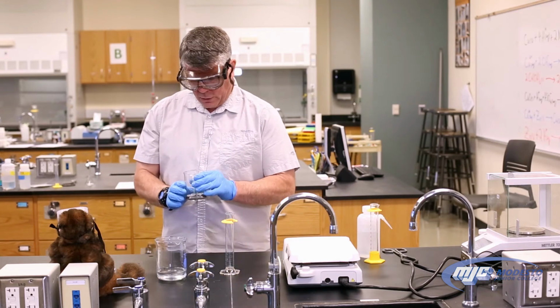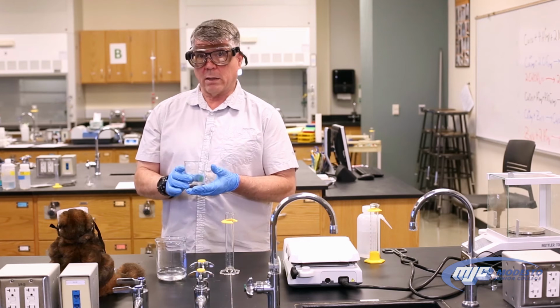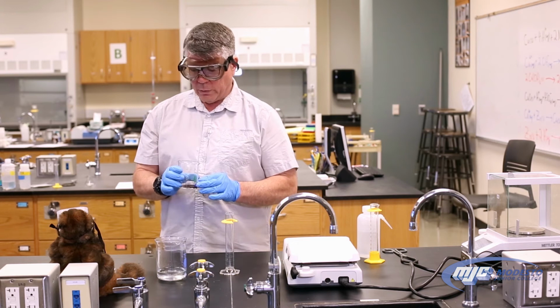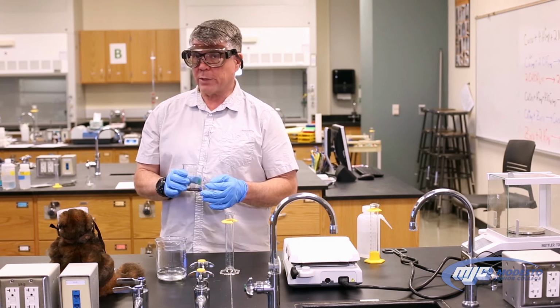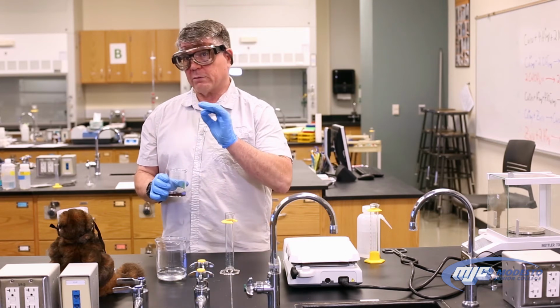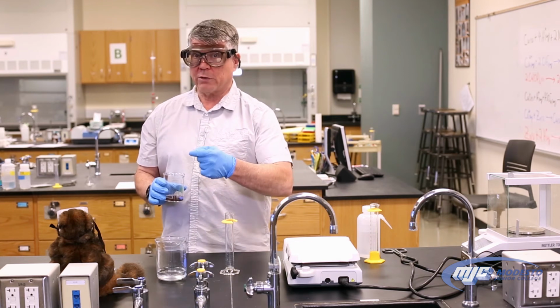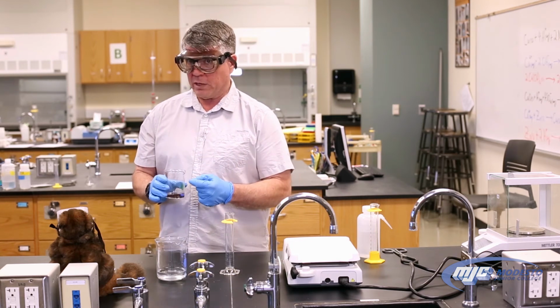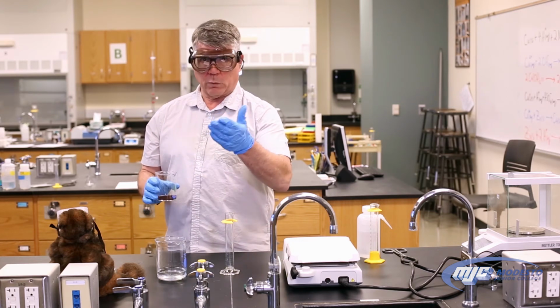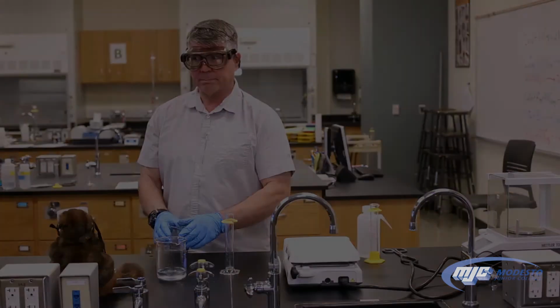Okay, so now there still is some zinc in there. In the end, we're going to dry this stuff and over the week, come back and weigh it the following week. So we want to make sure that we just have copper in there and nothing else, which means that the zinc that's probably still in there, we want to get rid of. So that's the next step: we're going to go back to the fume hood, add some concentrated hydrochloric acid. That will react with the zinc metal, producing hydrogen gas and dissolving it, and then we can wash that off of the copper. So let's go back over to the hood and do that.